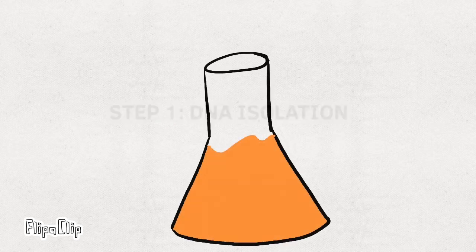Our first step in the experiment is DNA isolation. As a disclaimer, make sure not to contaminate this step, otherwise your procedure can't be repeated. Also, when in doubt, ask your instructor for help because they can usually tell when you're confused.